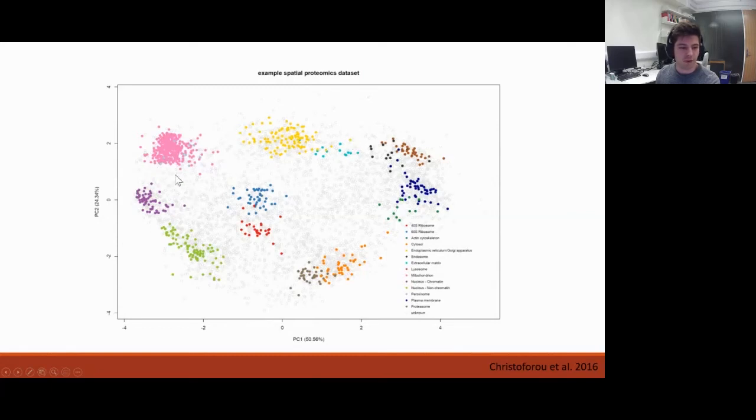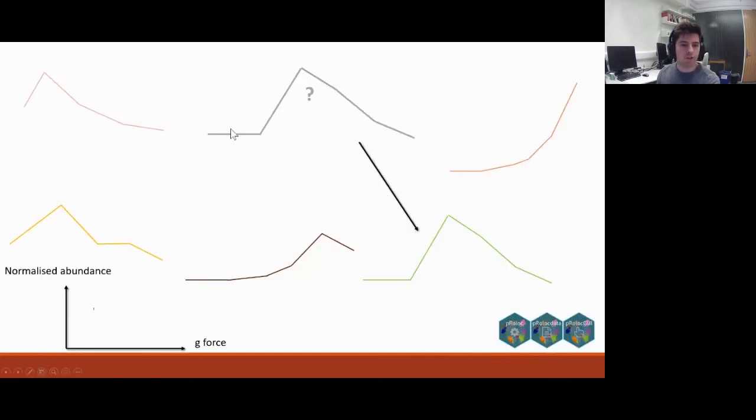And as you can see, we resolve a large number of subcellular components: small and large ribosomal subunits, nucleus, chromatin-associated proteins, mitochondrial proteins, and different elements of the secretory pathway. And for those proteins where we don't know the localization, we want to assign them to one of the particular localizations.